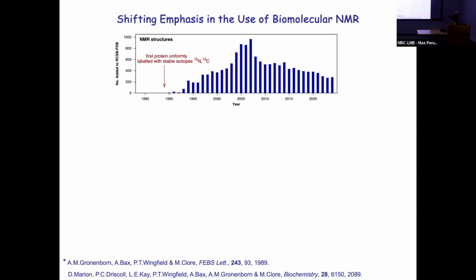The number of structures deposited per year peaked just before 2010, and it's tailed off since then. So we are redefining the way in which NMR is used in a biomolecular context. We wouldn't sell this primarily as a structure technique by itself.